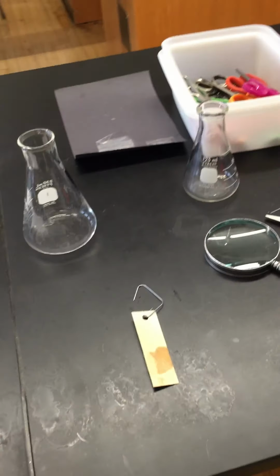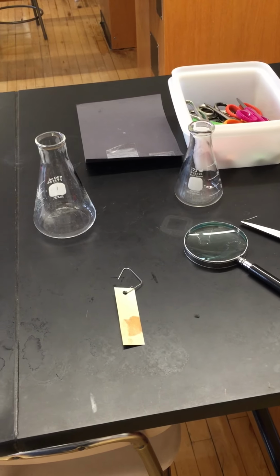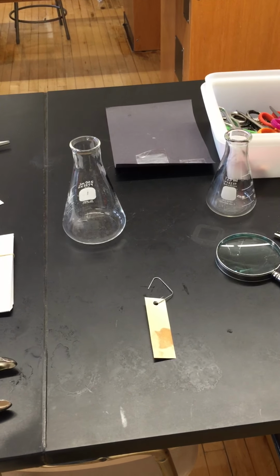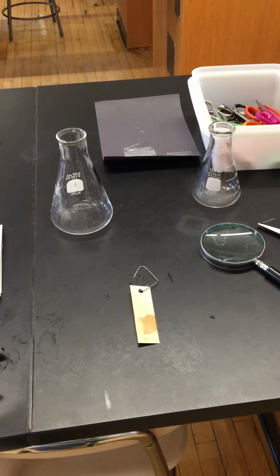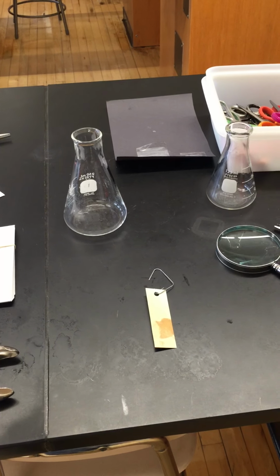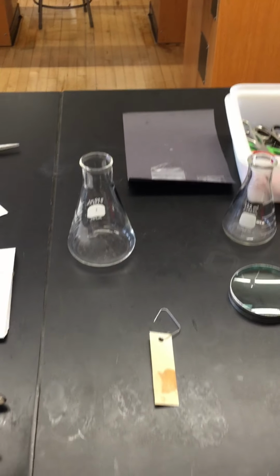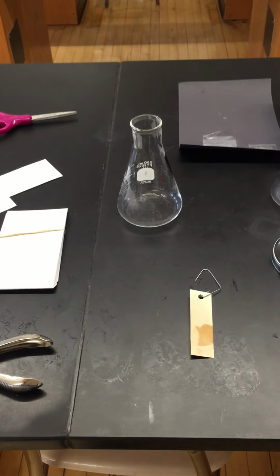Okay, so that's as simple as it gets for developing your fingerprints, using iodine as a reactant, essentially, to the oils in your finger. The reason why we're doing this particular lab during this unit is that iodine is one of those substances, along with carbon dioxide and another one that you'll have to look up, that sublimes. Okay? All right.